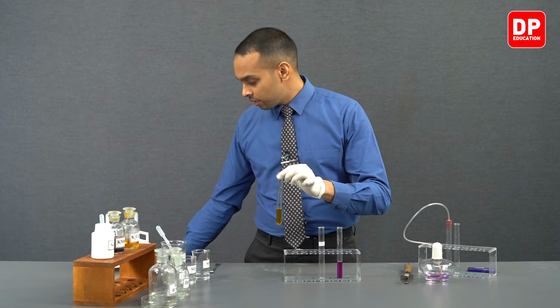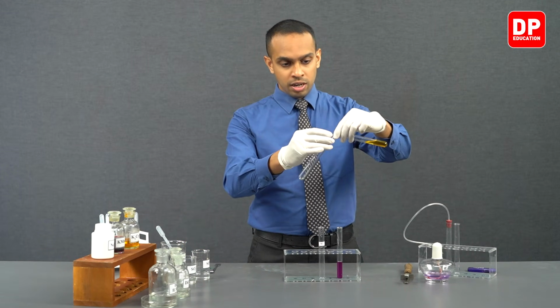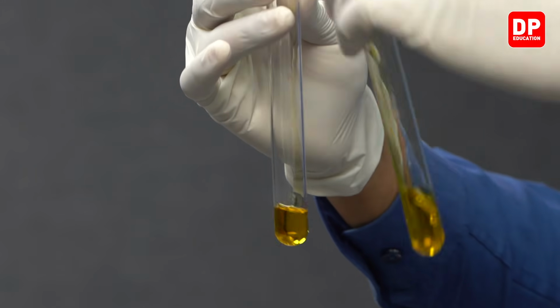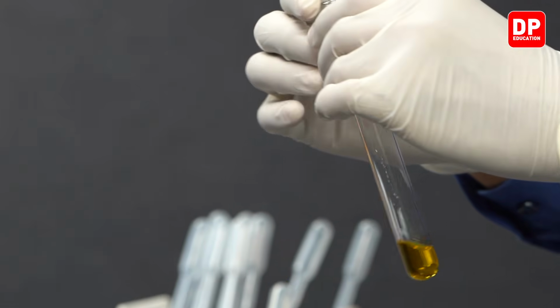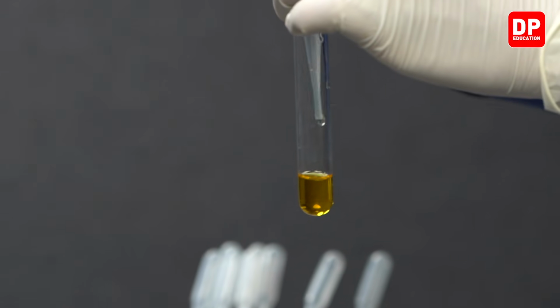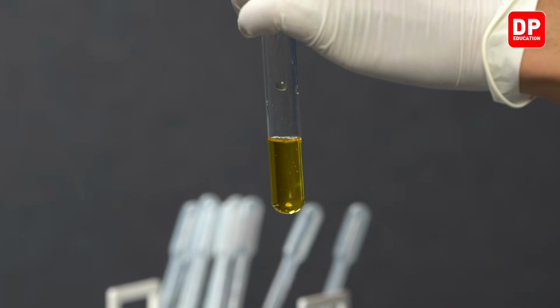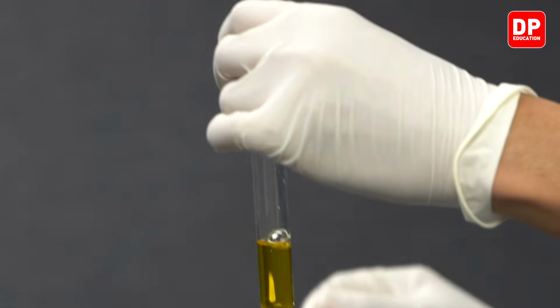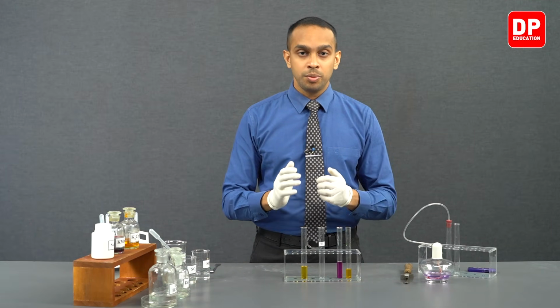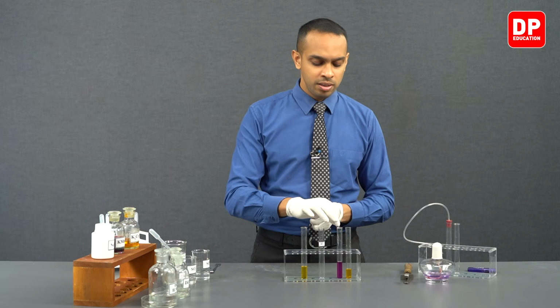So we will take another test tube and transfer a small amount of this solution to that test tube, and we will add water to dilute it further. Similarly, we will dilute acidified potassium permanganate solution as well.